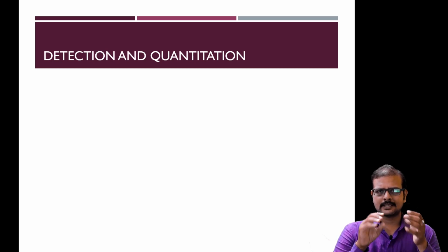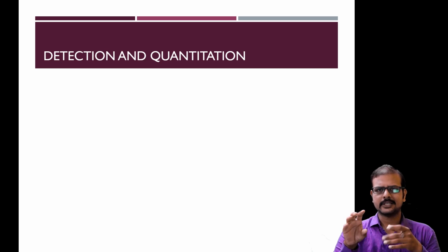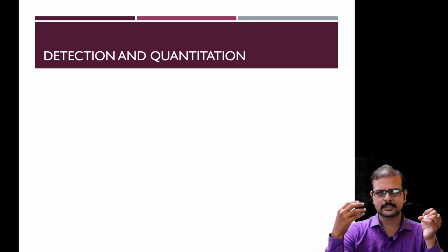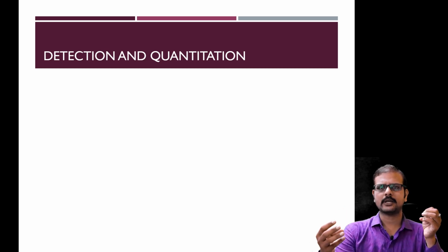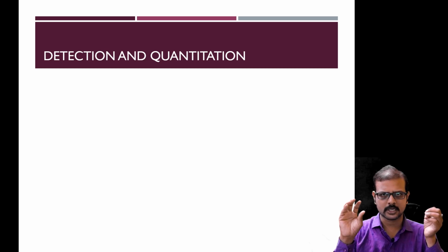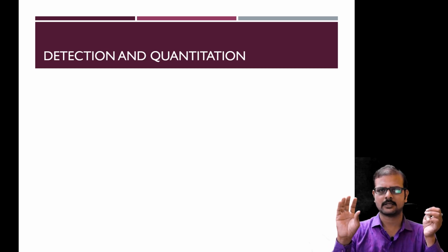They are accelerated such that they reach the detector. So the detector will collect all the positively charged molecular ions and fragment ions. Only the positively charged species are detected in the detector.